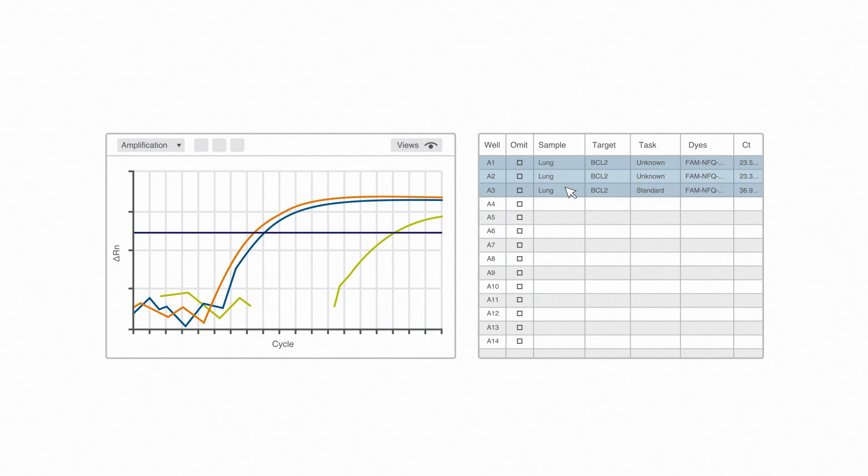But that is not a problem. With triplicates, we can clearly say that the CT of 37 is an outlier and should be removed. I simply click to omit, update my data by clicking Analyze again, and voila! I can move on and still use this data point for the sample.